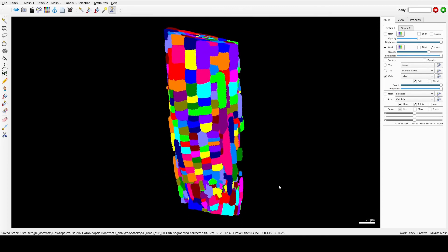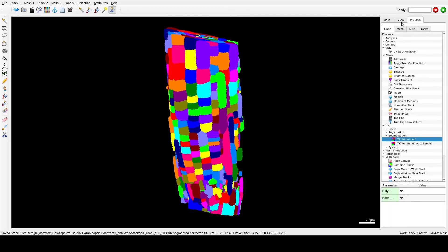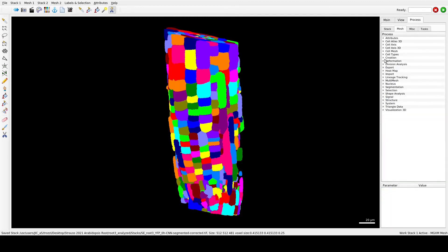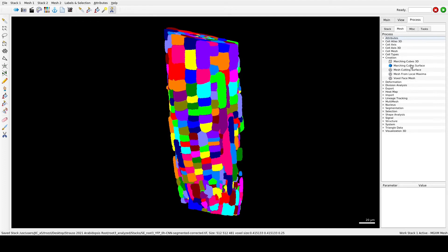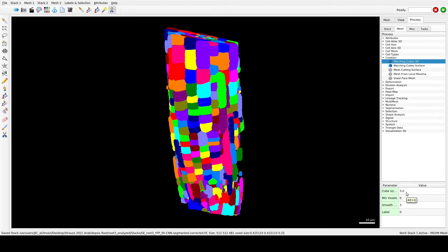Now you can extract the mesh using Process > Mesh Creation > Marching Cubes 3D. The cube size parameter defines how far apart the vertices are in the mesh. For a fine, detailed mesh, the cube spacing should be small — try something like 2, for example. The trade-off is a larger file size for the mesh.